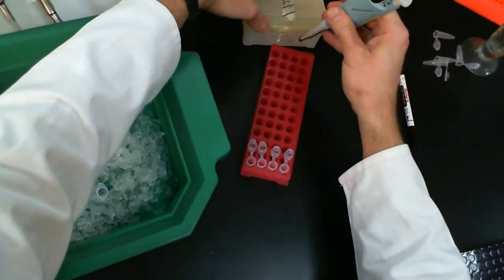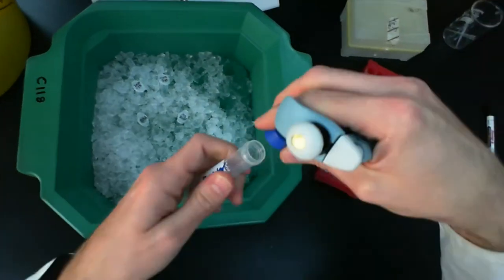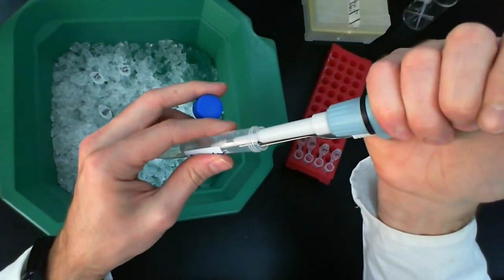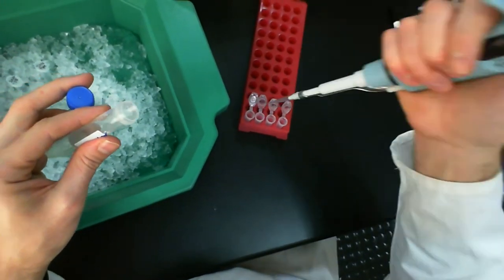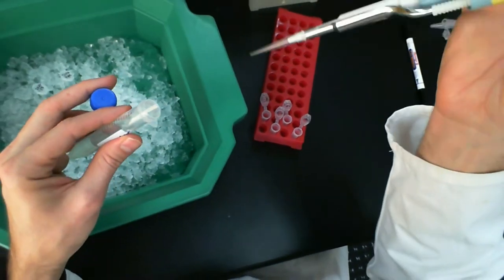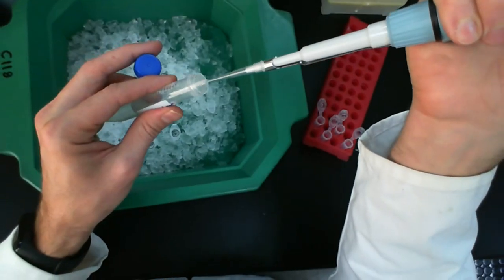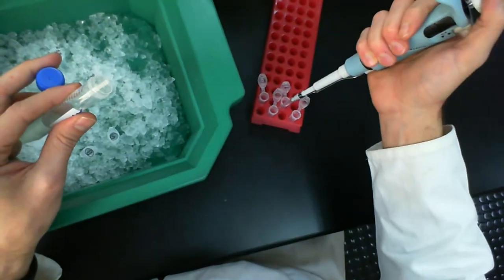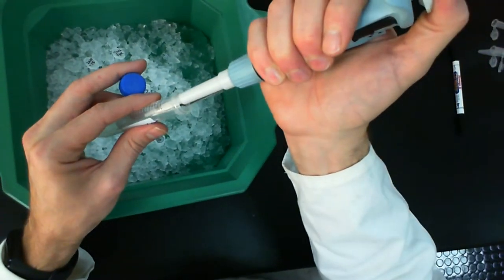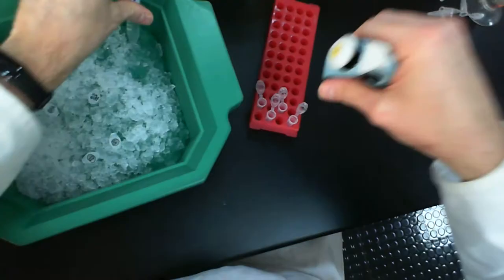I'm going to put on a tip and add the water to the two tubes that require 10 microliters. That's tube number 1 and tube number 3. Here we go. That's tube 1, and tube 3 requires 10 microliters. I'm going to move those over by one so I know those are done. Then I'm going to change the volume to 12 microliters for the next two tubes, and add 12 to tube number 2 and tube number 4. Move those over as well, and that tip we can get rid of.